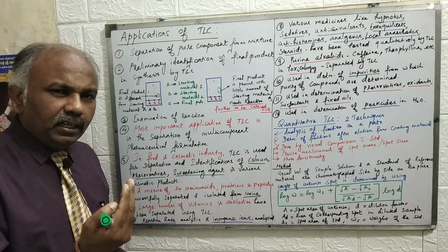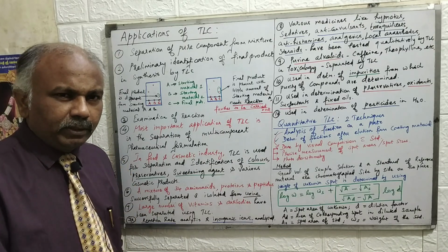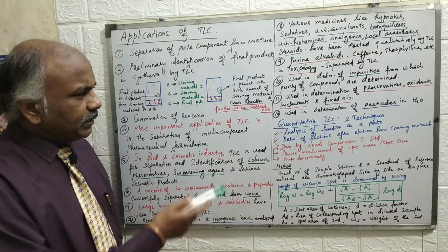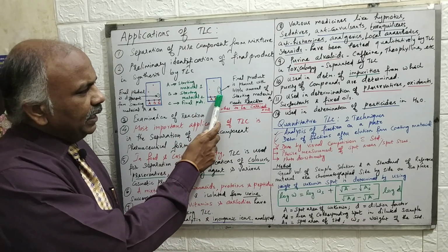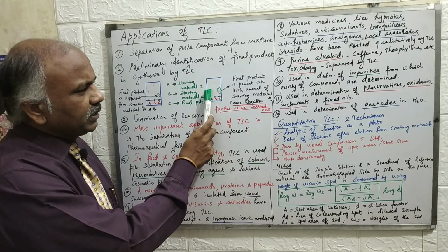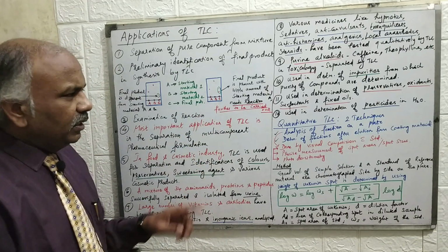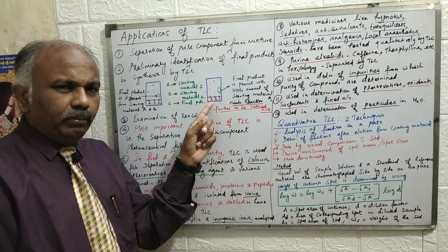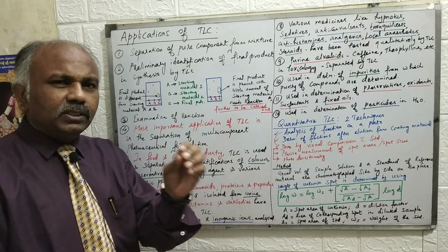Further final confirmation can be done with the help of IR spectroscopy as well as NMR and mass spectrometric analysis. Now, say for example, if I am spotting starting materials A, B and C, where C is the product, and at the same time there is also a small spot coinciding with spot A. This clearly shows that you are getting a final product which is different from starting materials A and B, but starting material A is also present in small quantity.